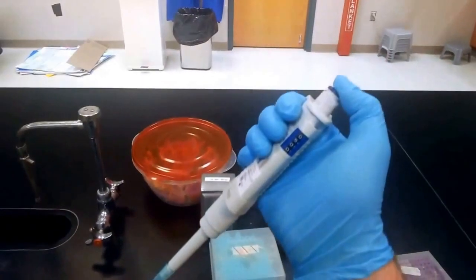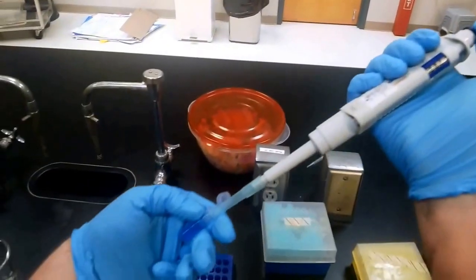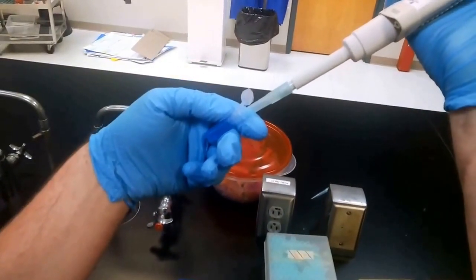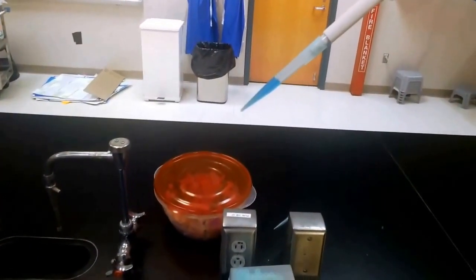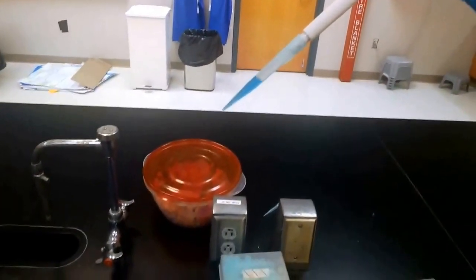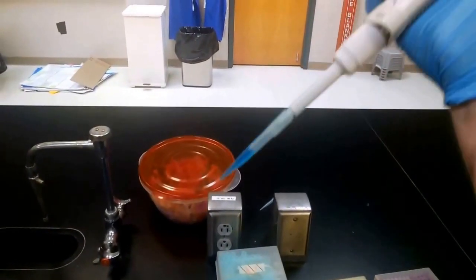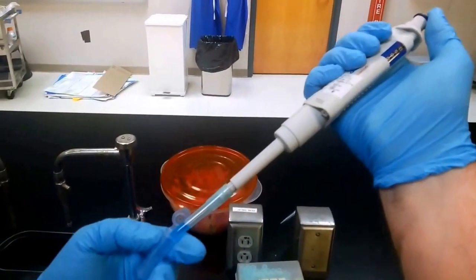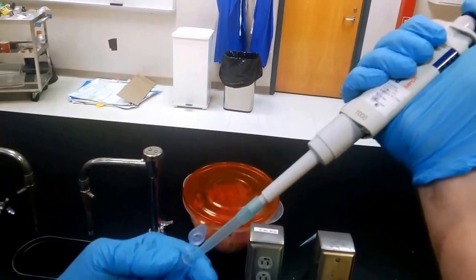Depress to the first stop. All right, dip our tip into the solution that we're pulling from, pull up slowly. As you can see, that's quite a bit more than we moved last time—it's about 500 microliters.